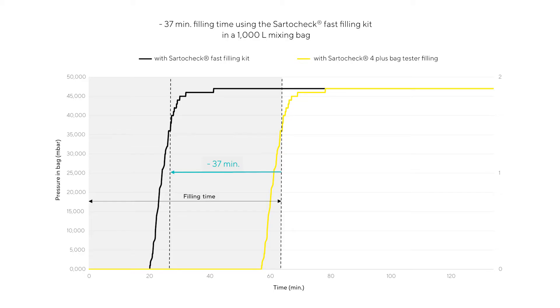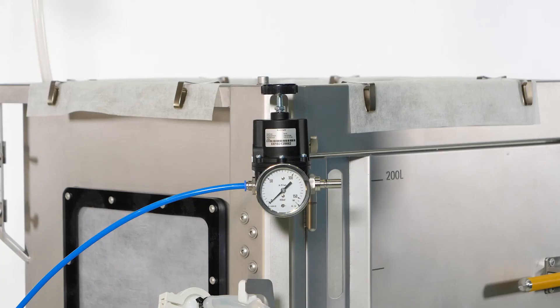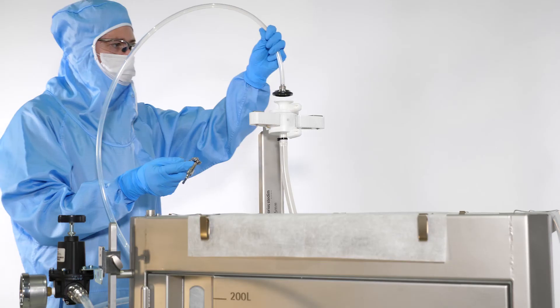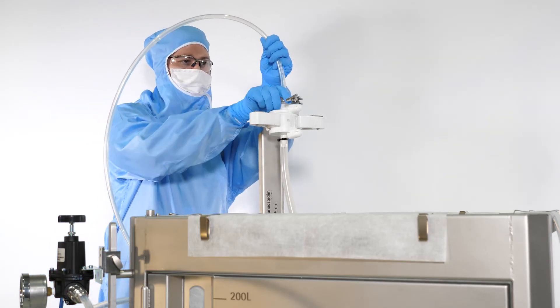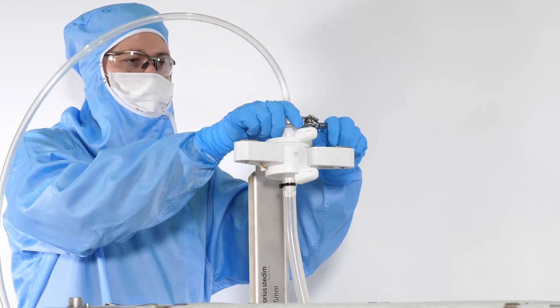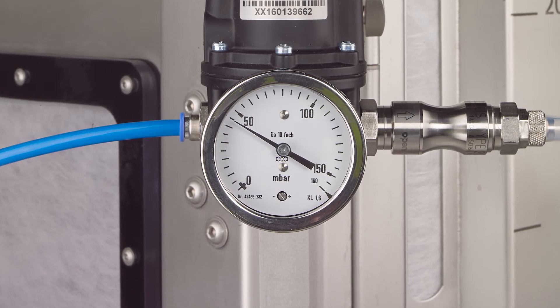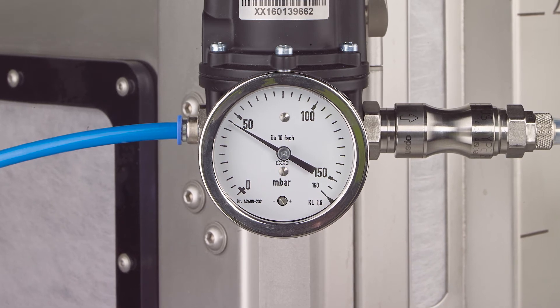The fast filling kit pre-fills mixing bags with air, shortening the test time. Connect the inlet of the fast filling kit to the compressed air supply and the outlet to the testing tube for 3D bags. Connect the testing tube to the Startopore air filter. Open the compressed air supply and check that the pressure regulator is set to the correct filling pressure according to specifications.